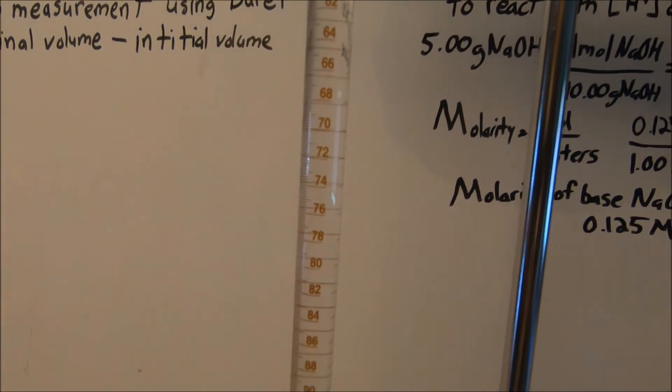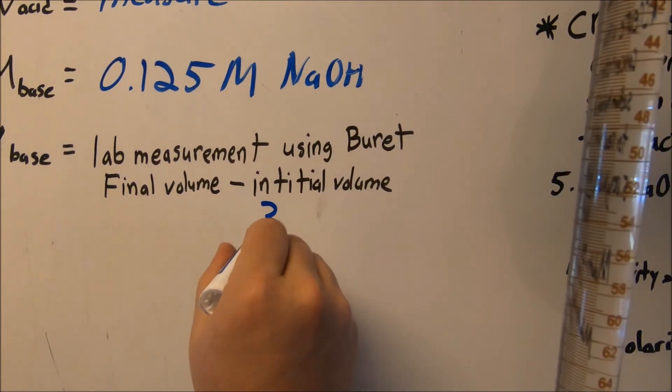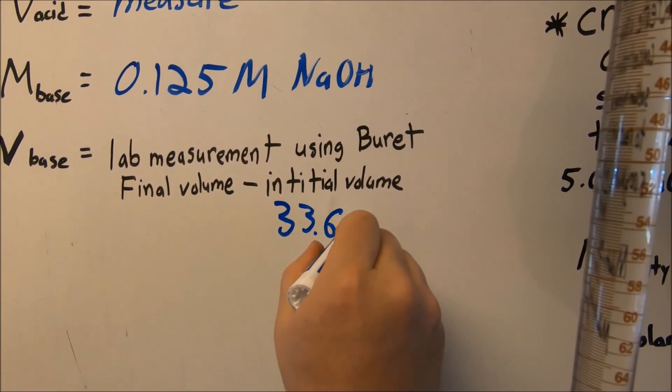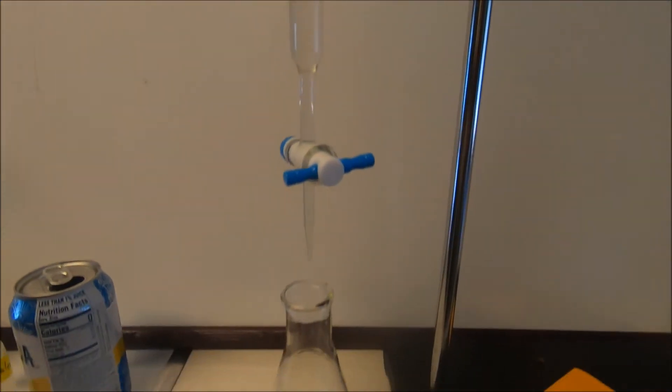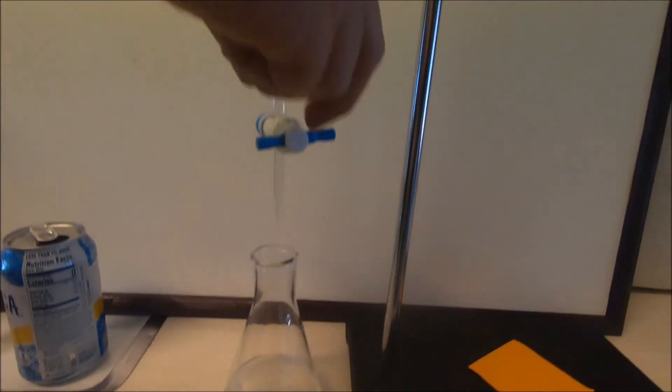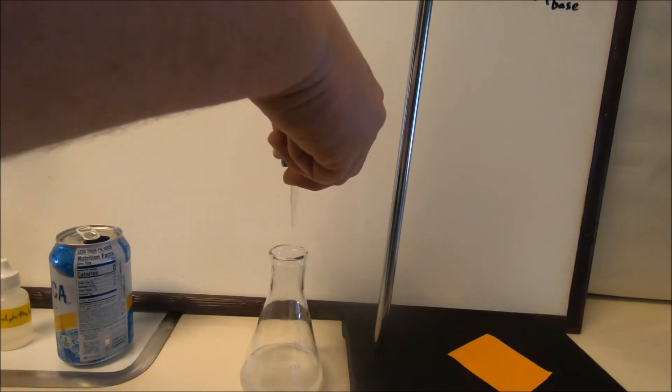So our initial volume at 33.6 milliliters. And now what we're going to do is we're going to add some sodium hydroxide to our unknown solution.